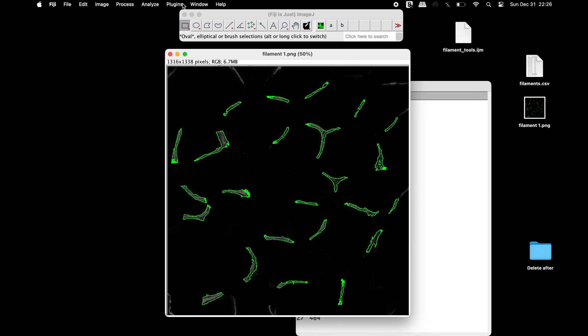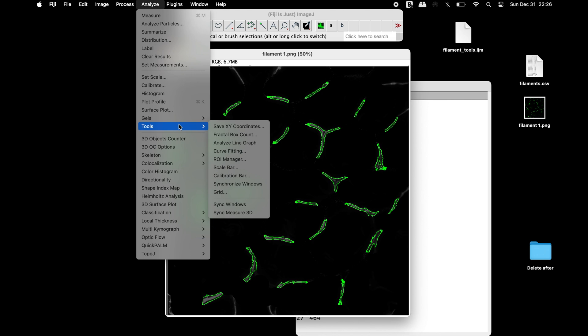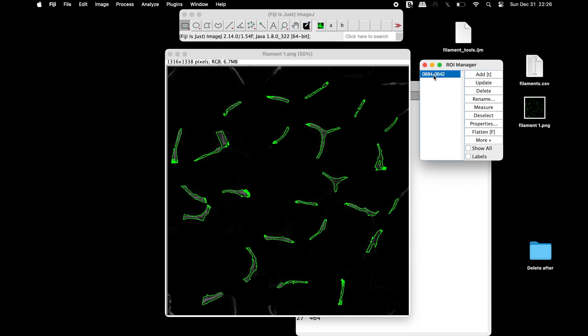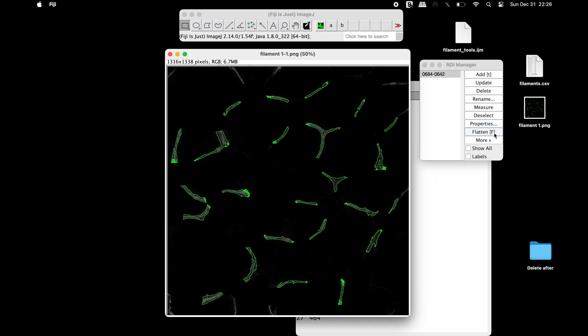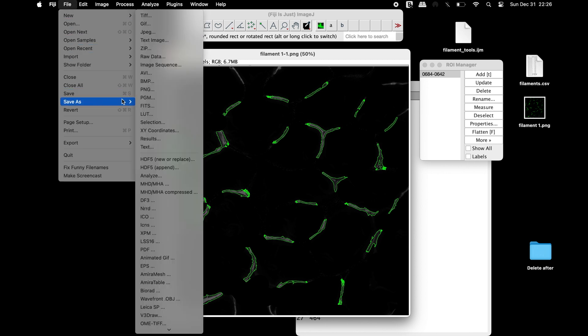Next, click on Analyze, Tools, and select ROI Manager. Now, click Add in the ROI Manager window and flatten the image. This image can be saved in any format of your choice.